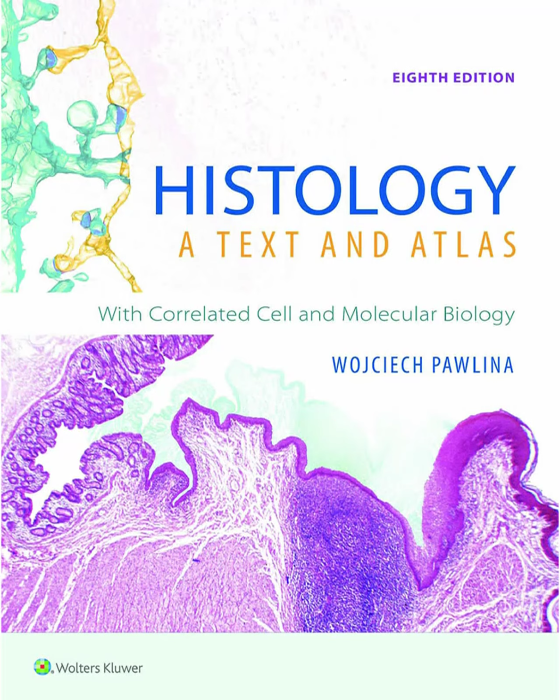And speaking of misinterpretations, we also need to be constantly aware of artifacts. Artifacts, like errors? Yes, basically defects introduced during any stage of the preparation: fixation, embedding, sectioning, staining. Maybe a wrinkle in the section, or stain precipitate, or shrinkage. They aren't real biological structures, and learning to recognize them is critical. Okay, good point.